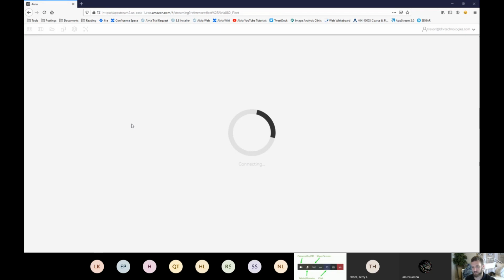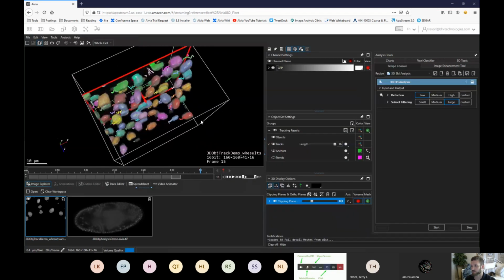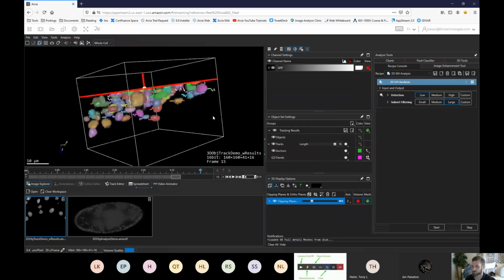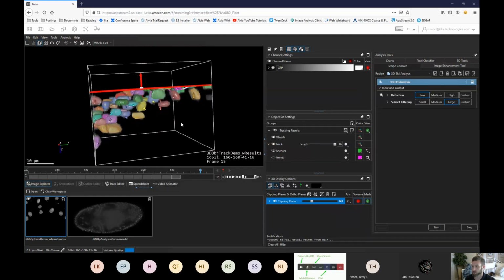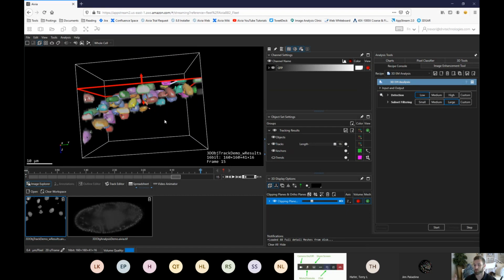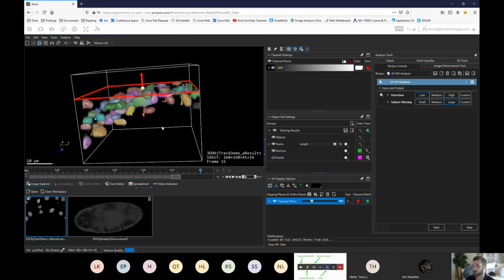Well, y'all have some free time to experiment while I restore my Firefox tab. Look at that! Wow, that was quick. That's an interesting lesson. So apparently, if you're using Aivia Web and your browser crashes, your session can resume right when you left off. That's really cool. I haven't seen that before. Okay, sorry. So I'll resume.